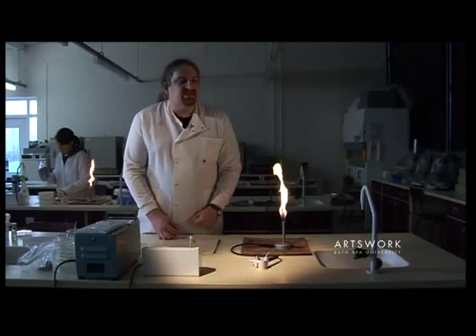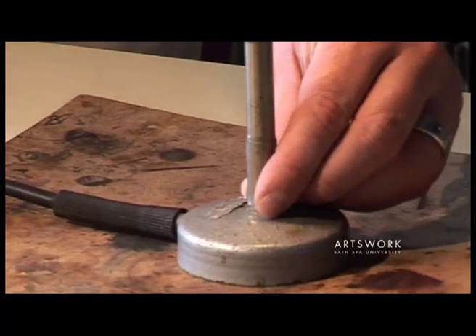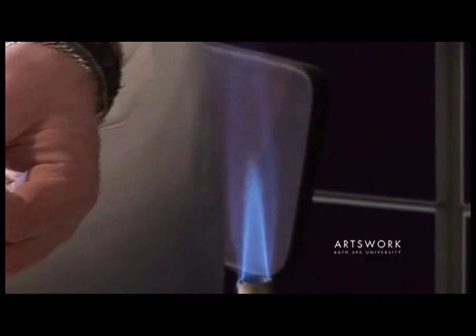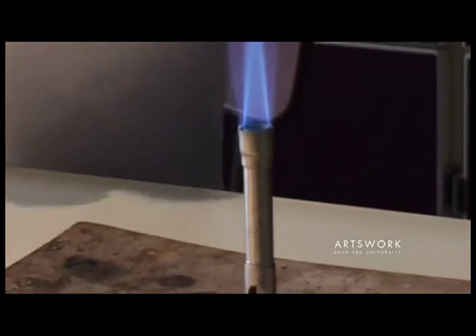When we want to use the Bunsen for sterilising equipment, turn the metal collar at the base — as you can see, it's opened up the air hole for a much higher rate of airflow, resulting in this much hotter but blue, almost invisible flame.